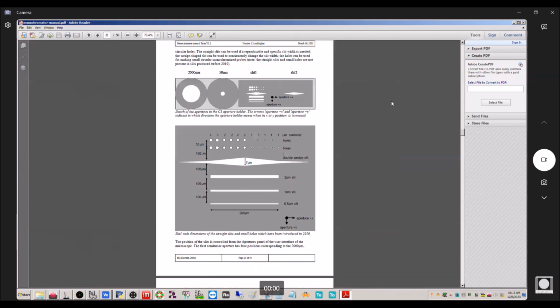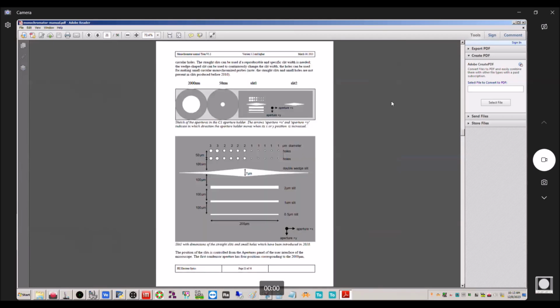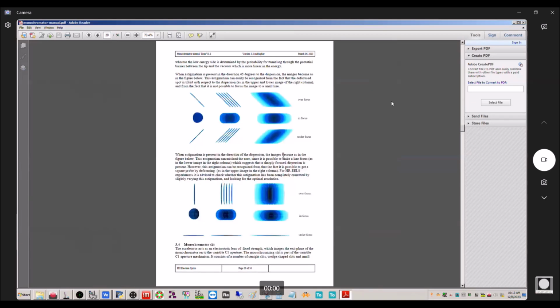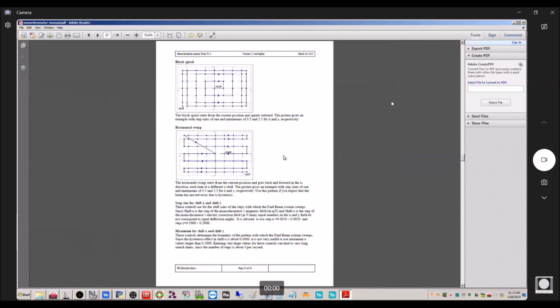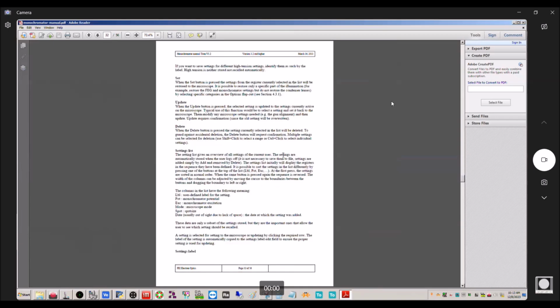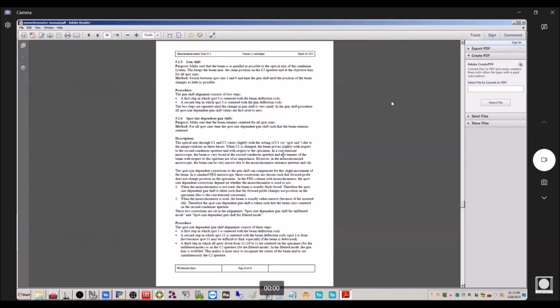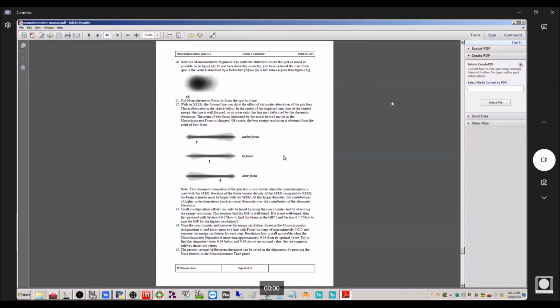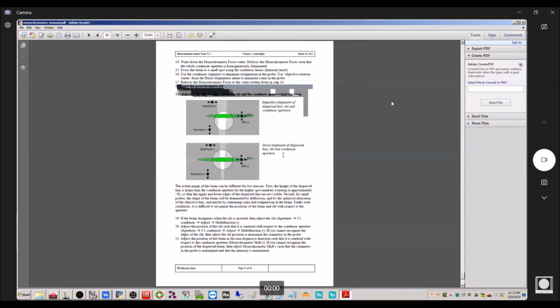This is close right here, but this is not. Ah, here it is. Perfect.